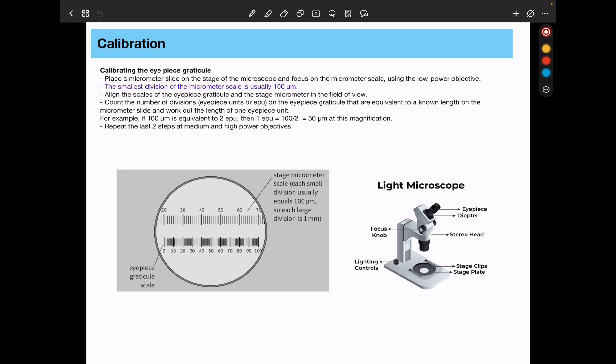So here the smallest subdivisions of the micrometer scale are going to be a hundred micrometers. So we're going to find out by aligning these. You have to make sure that these big ones are aligned with some of these ones here. So we align the scales of the eyepiece graticule and the stage micrometer in the field of view. This is the field of view, the circular thing that is your field of view. You will count how many subdivisions, these are going to be the eyepiece units, on the eyepiece graticule that are equivalent to a known length on the micrometer slide. And then we can work out the length of one eyepiece unit.